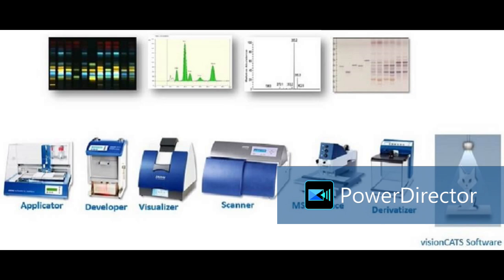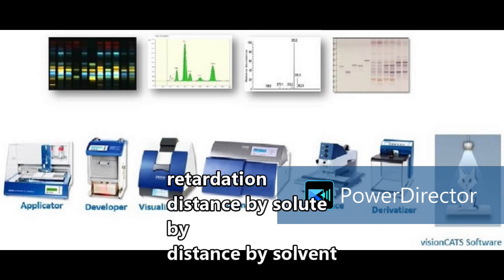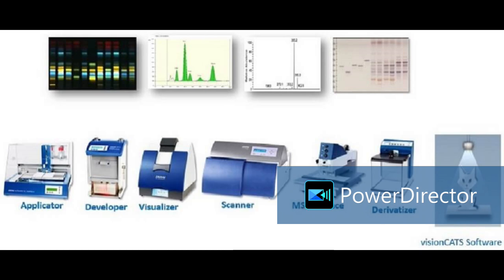Here, this is the TLC or HPTLC plate. This is the RF value scale, 0.1 to 0.9. On this scale we can see different components are separated, and we can find out the RF value, that is the retardation factor: the distance traveled by solute divided by the distance traveled by solvent, either from the application position or from the bottom of the plate, from anywhere you can take.